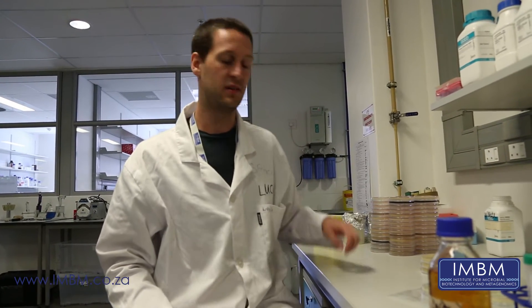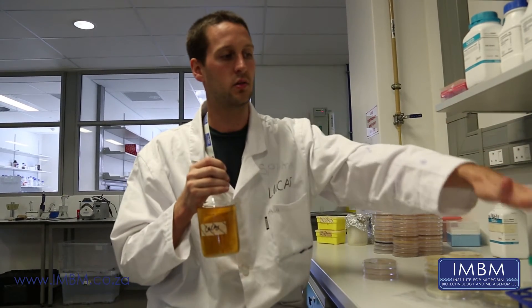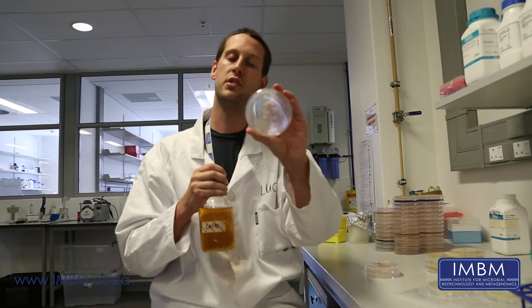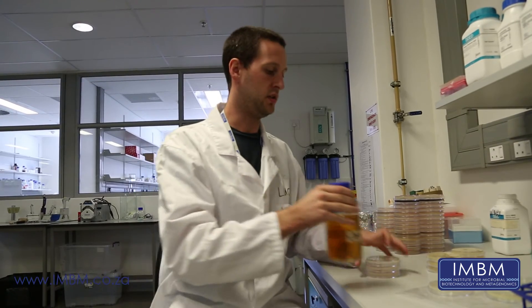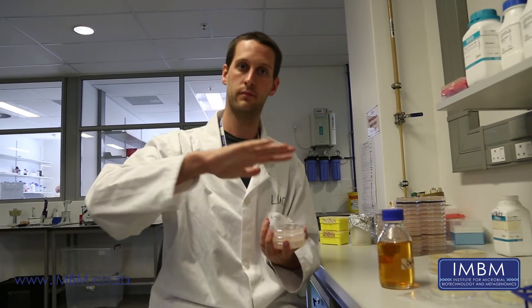In order to carry out the antibiotic assay, you have molten agar that's about 50-55 degrees Celsius. You add your bacteria to that agar and then you pour over your test plates. Then you incubate until the next day, and any bacteria which produces a zone of clearing in the top agar is able to produce an antibiotic that's able to kill these test strains.